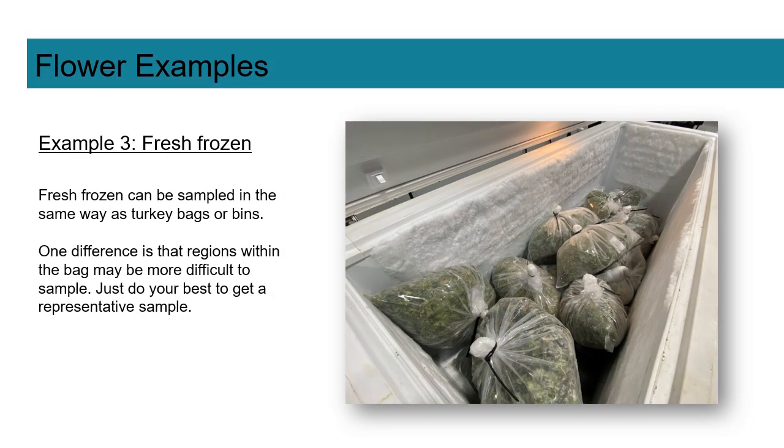Example 3, fresh frozen. Fresh frozen can be sampled in the same way as turkey bags or bins were described earlier. One difference is that regions within the bag may be more difficult to sample. Just do your best to get a representative sample.